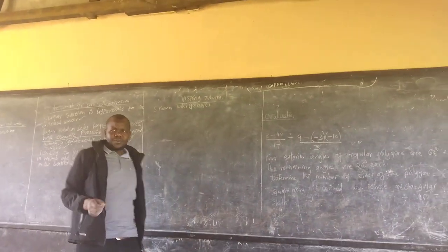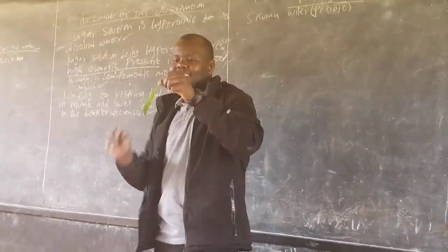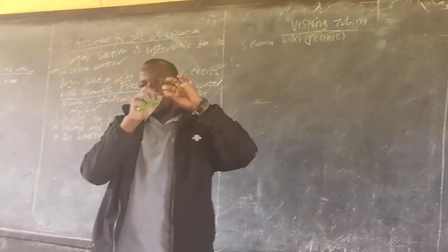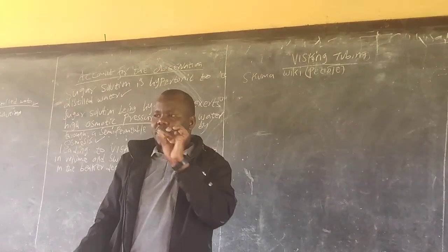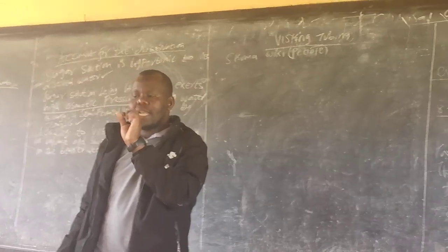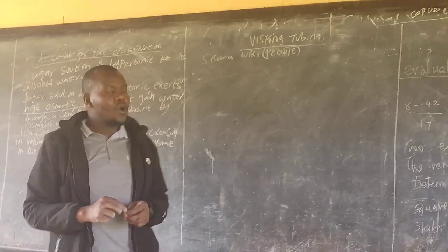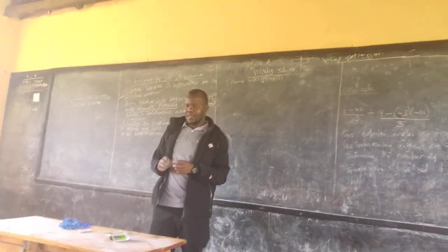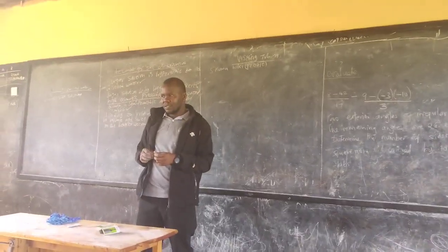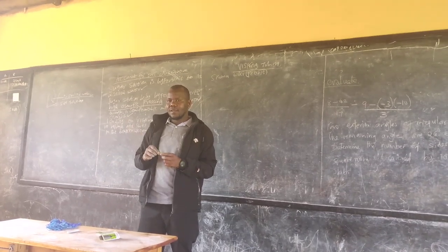Which one is a petiole? This one is our petiole, the upper section where we extracted from the stem, right? So they were told to cut that sample of a section. Now with this we can perform various experiments: a slit, a lengthwise cut, and the curvature.